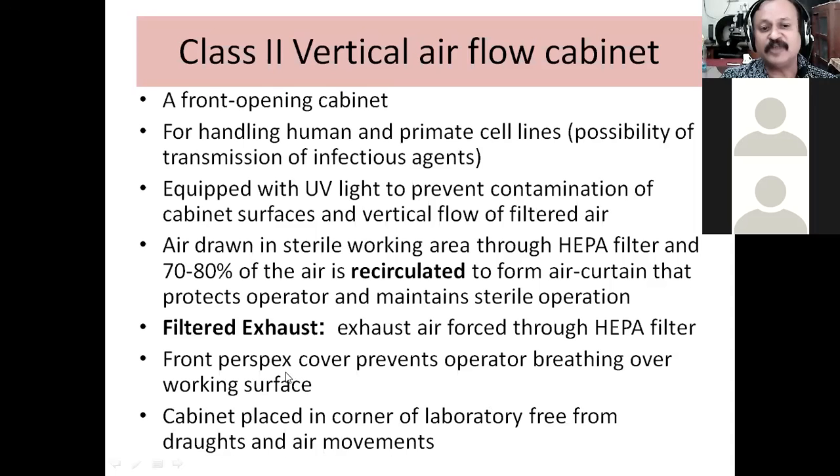Then there is a front perspex cover, that is a glass door, and the operator is looking through the glass inside the cabinet, and therefore it is protecting the operator on one hand, and on the other hand, the operator cannot breathe on the working surface. And therefore your material also is protected from the operator, right? Only the hands of the operator are inside, he is working in that area, but his face is covered.